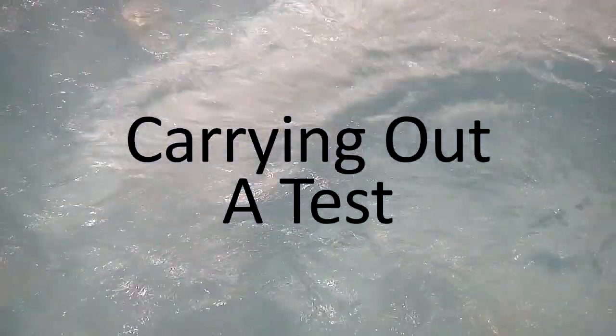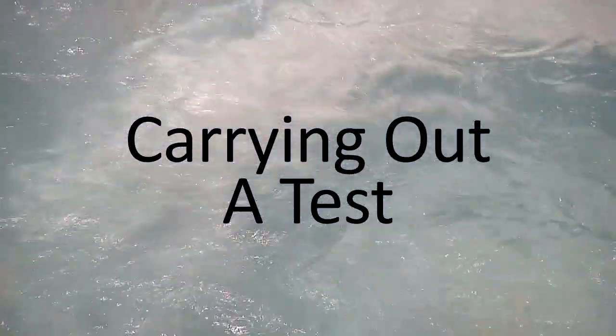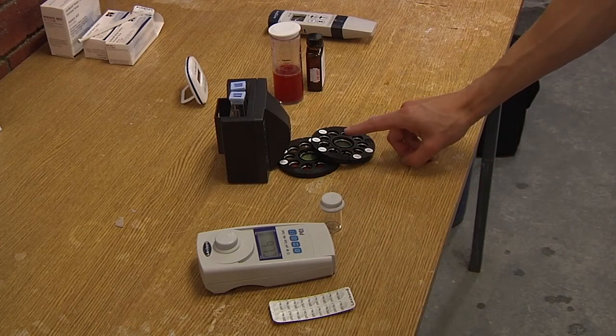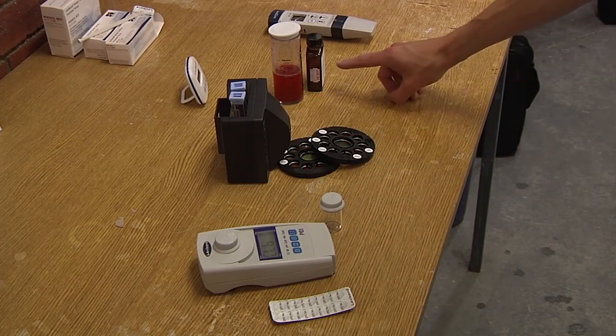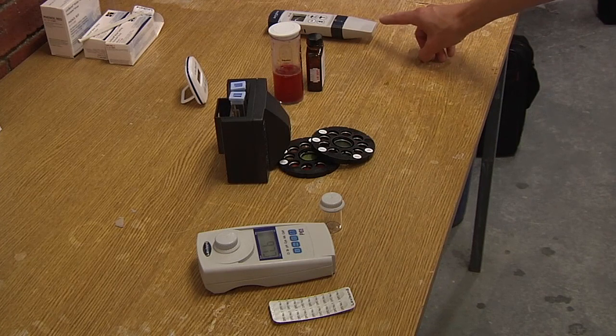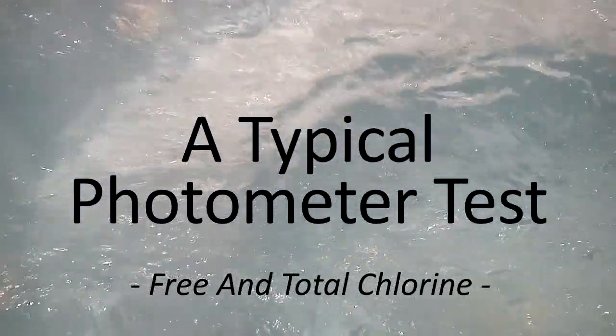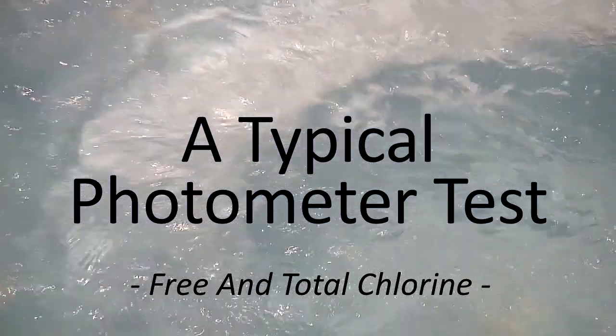A variety of equipment is available for accurate water testing: photometers, comparators, tablet count kits, and meters. In this example we will be using a Lovibond photometer and tablet reagents.